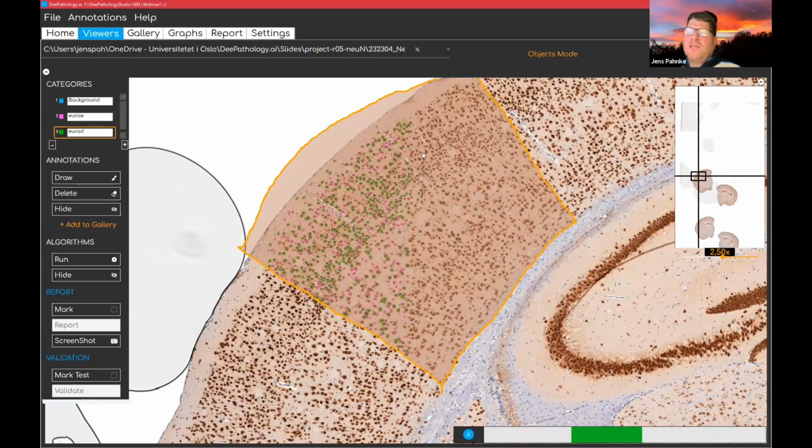The same here with the neurons. We taught the neurons, and we're now detecting the neurons in different colors, darker ones and brighter ones. We can also use it according to the shape, small and larger neurons is also possible. And this is all within 1 hour. You establish 2 detection modes that run nearly remotely in the background now. So I think it's really efficient, very nice and precise.